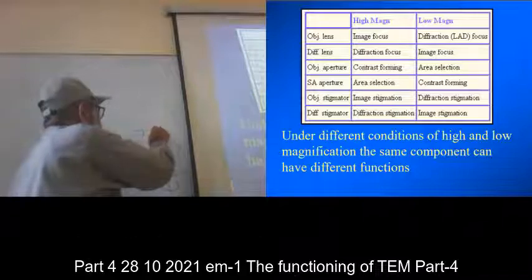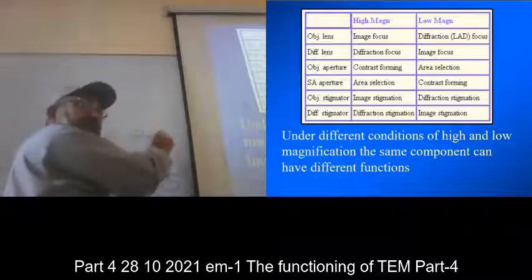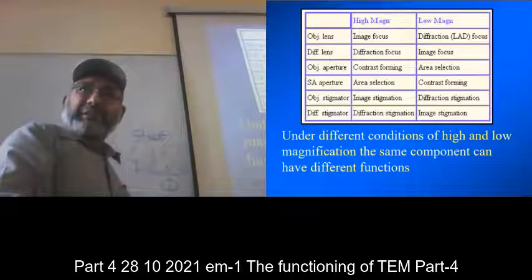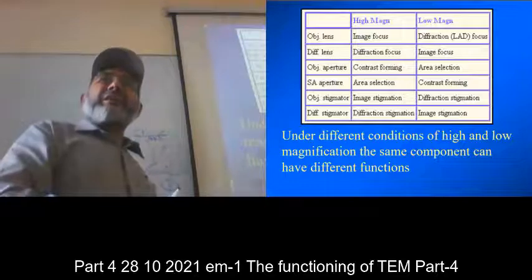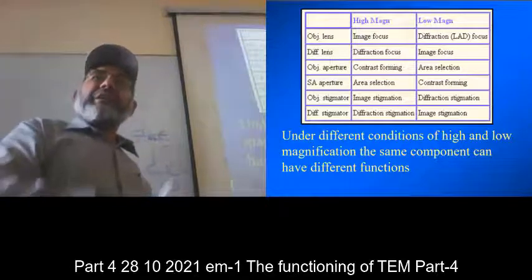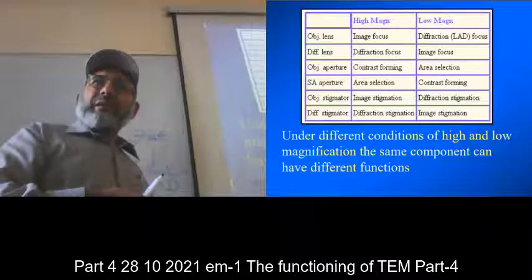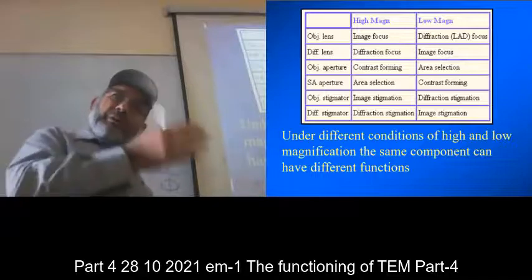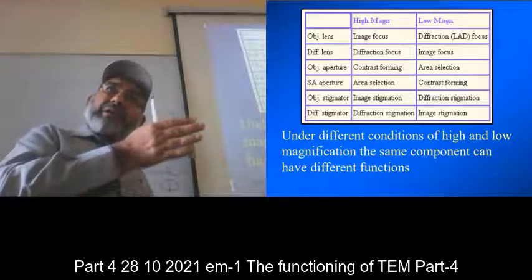12 millimeters, say, and instead of this I take here as the center, then it will be 12.3 or something like that millimeter. So 0.3 millimeter in angstrom means 0.3 times 10 power 7, right?